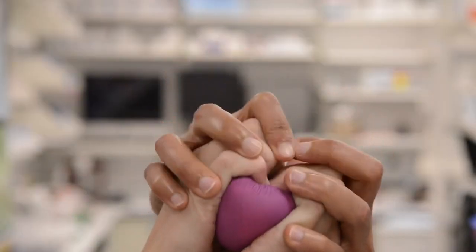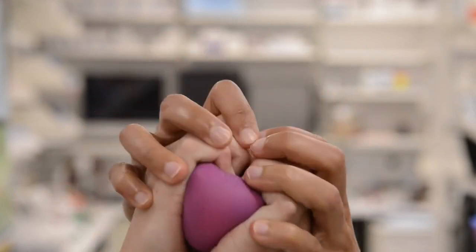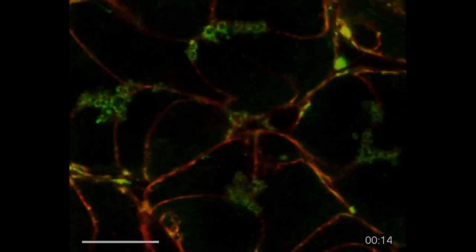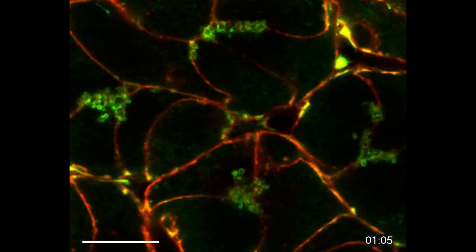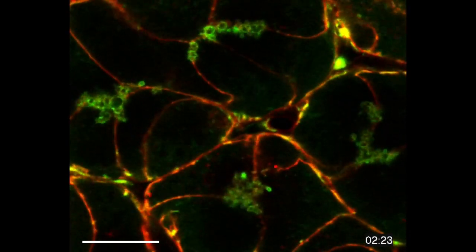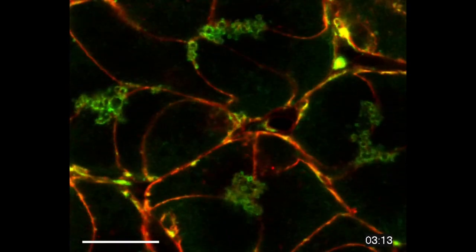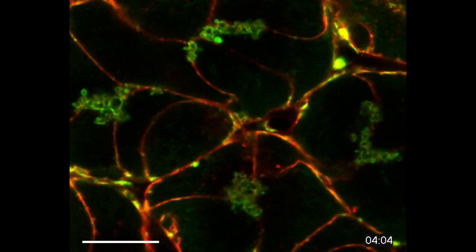Like the fingers squeezing this ball, we will show you how we studied this process. In order to see the actin appearing on the vesicles, we used mice engineered to express a fluorescent marker for filamentous actin in green and a marker for the plasma membrane in red.